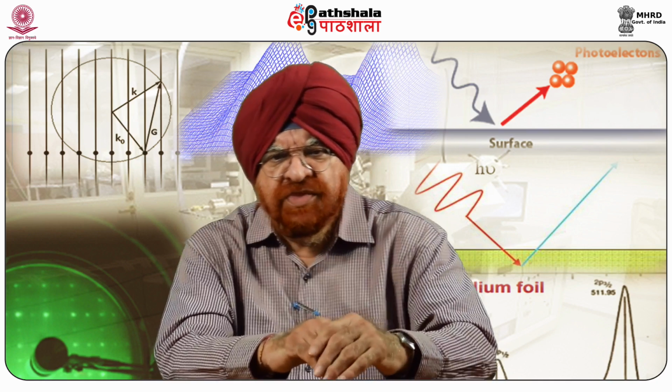There are many disadvantages when we use this technique. There are some shortcomings, limitations or difficulties when working with AFM and magnetic force microscopy, such as the recorded image depends upon the type of the tip and magnetic coating, which is due to the tip-sample interactions. Magnetic field of the tip and sample can change each other's magnetization, which can result in nonlinear interactions. Continuing with the disadvantages, this hinders the image interpretation.